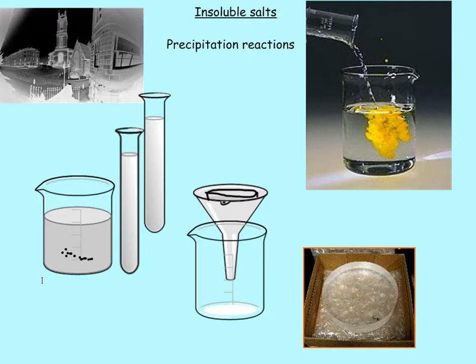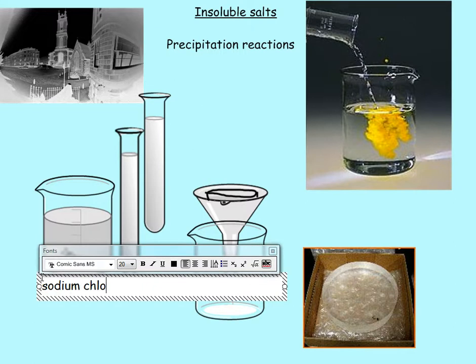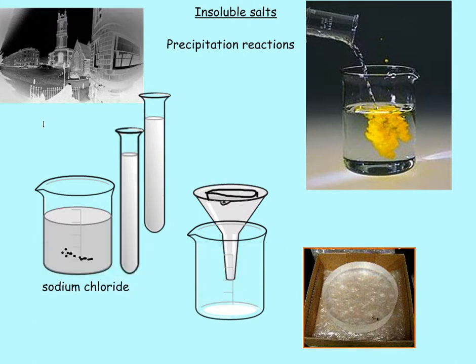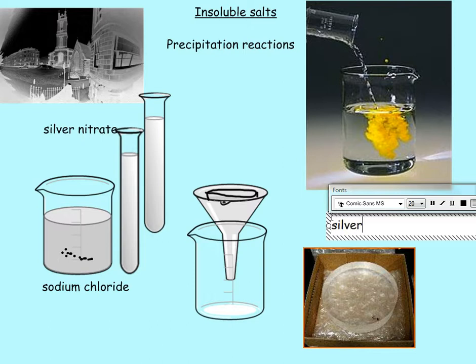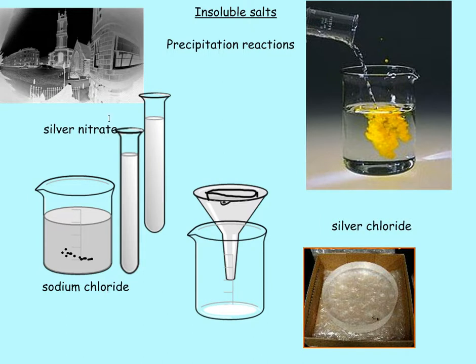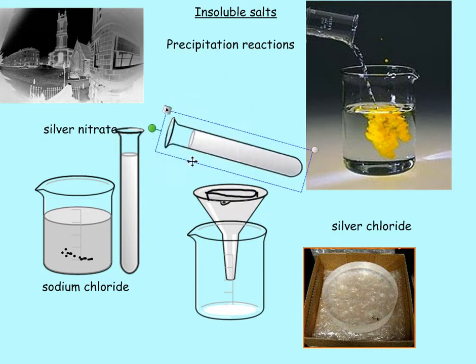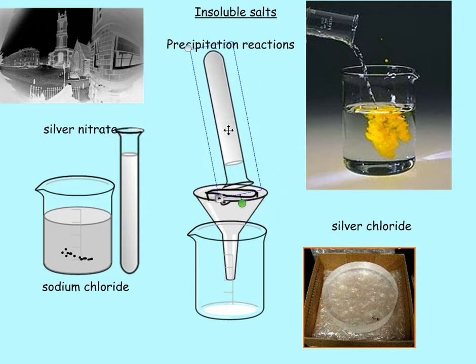So we had sodium chloride and we added silver nitrate, and we ended up with silver chloride crystals which I'm pouring into a petri dish. You can see that the silver has taken the chloride, and the sodium has taken the nitrate — so we get silver chloride as our insoluble salt.